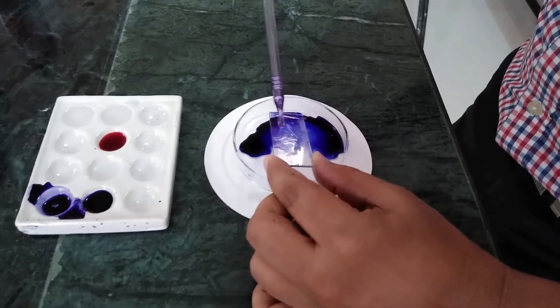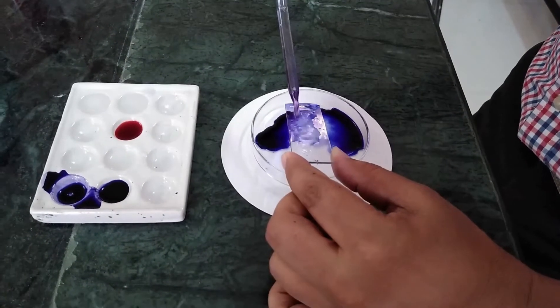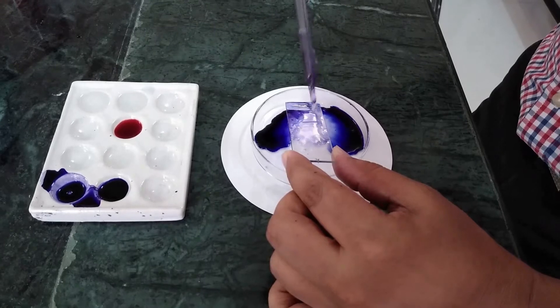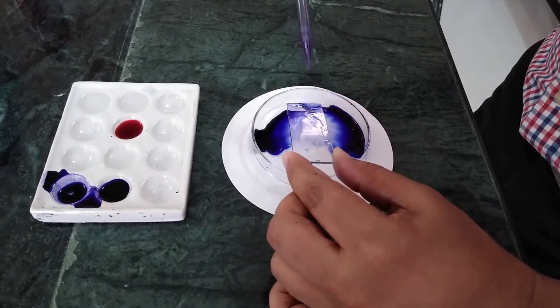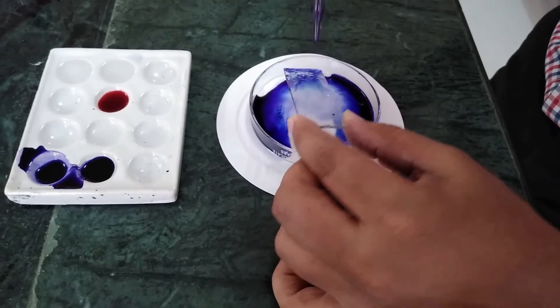After that, gram iodine solution is applied over the slide and washed with clean water. Then, 95% ethyl alcohol is applied over the slide.